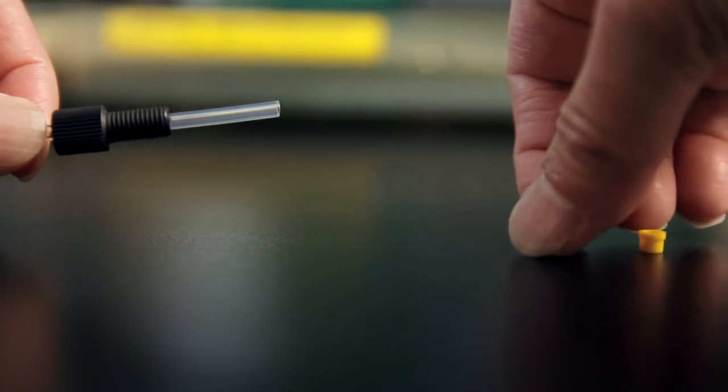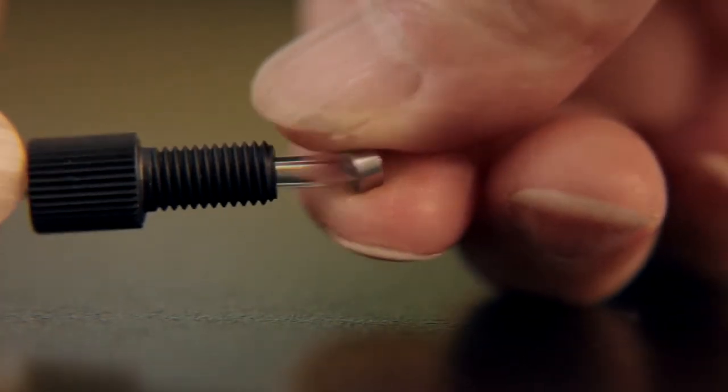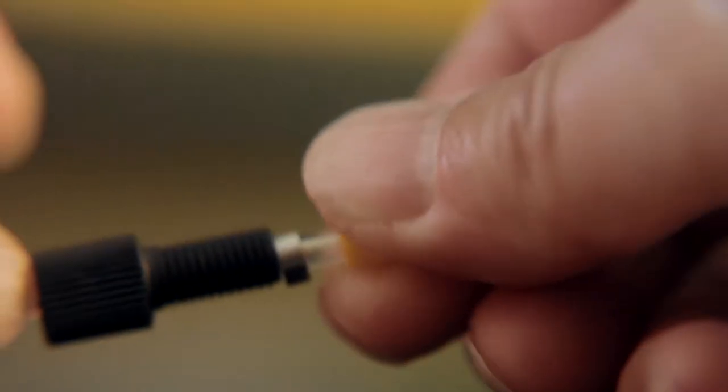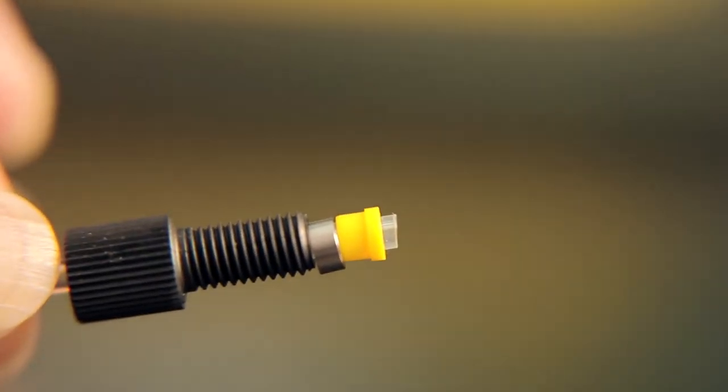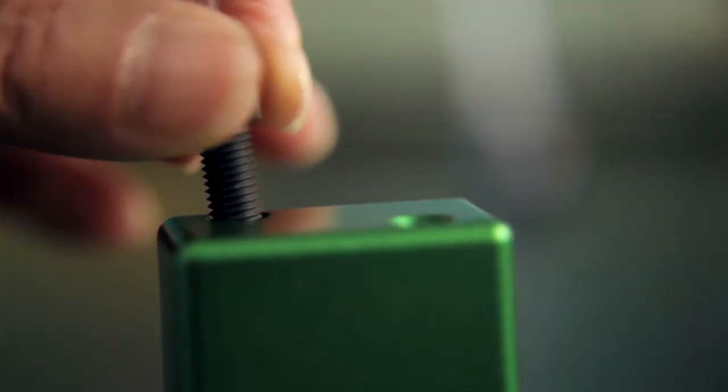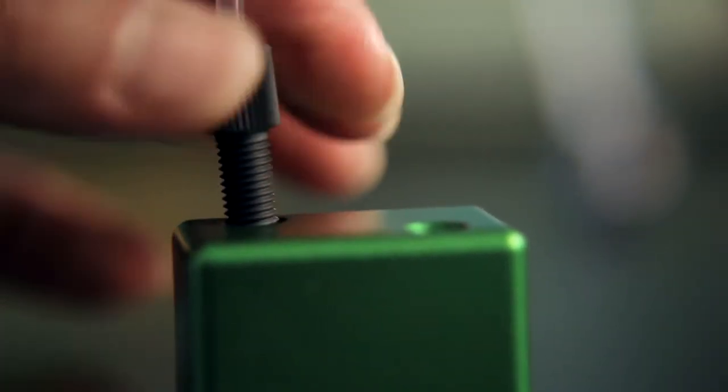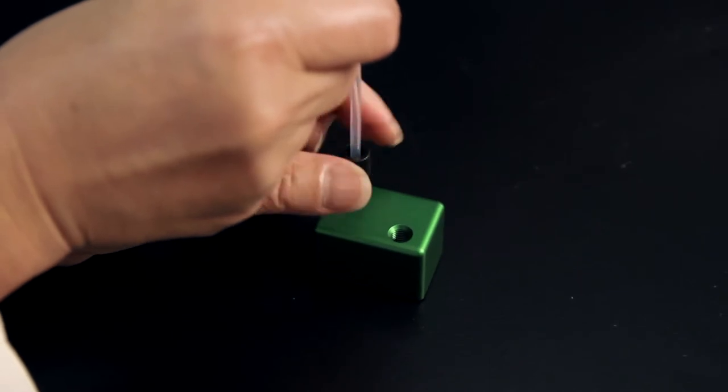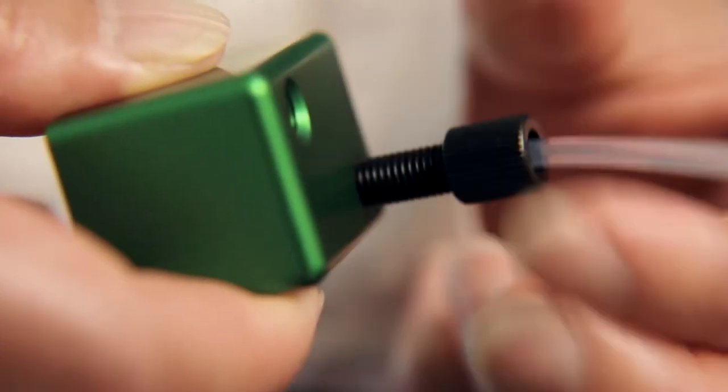Next, slide a 1/4-28 nut onto the sample end of the tubing, followed by a lock ring and a yellow ferrule, with the blunt end of the ferrule facing away from the nut. Push the tubing through the fitting until the tubing reaches the bottom of the NGC fitting tightener, and then slide the ferrule and nut toward the tightener and finger tighten.